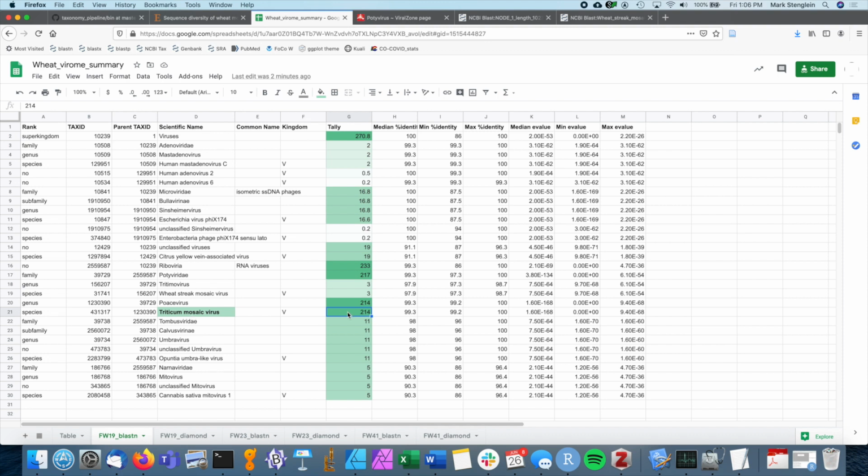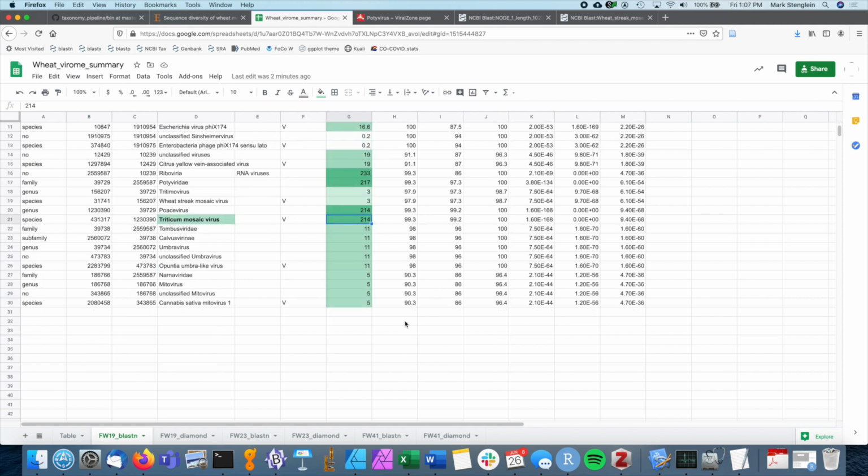So I suspect that this is a 10 kb genome. The reads are about 150 bases long, so 214 reads times 150 bases per read is going to give us about 32,000 bases of sequence information. So that means that over the entire genome, there should only be, on average, about 3x coverage, 30,000 divided by 10,000. So we're going to have pretty low coverage across the genome, and there's probably going to be gaps in coverage. There's probably going to be regions of the genome where there are 0 reads covering that part of the genome. So it's probably going to be a fragmented assembly.